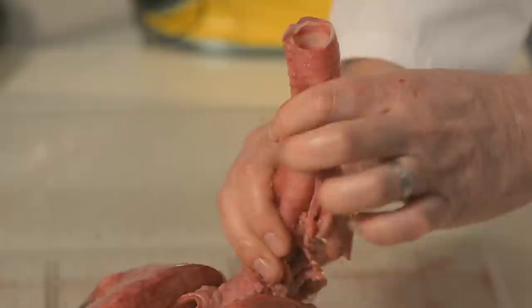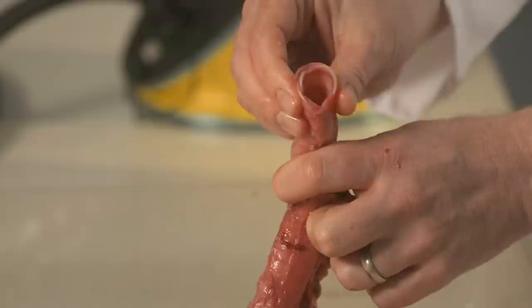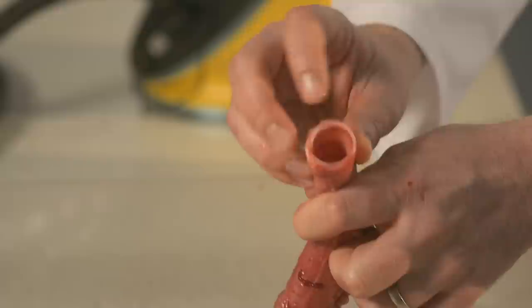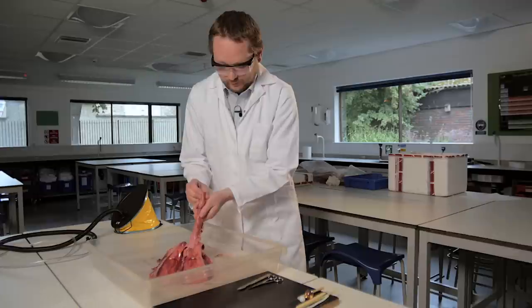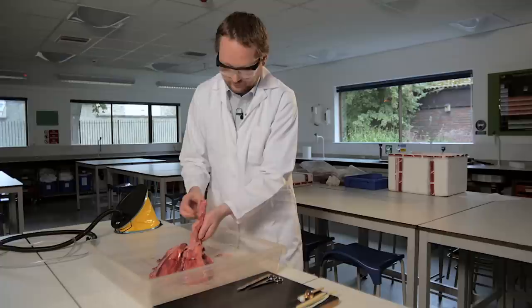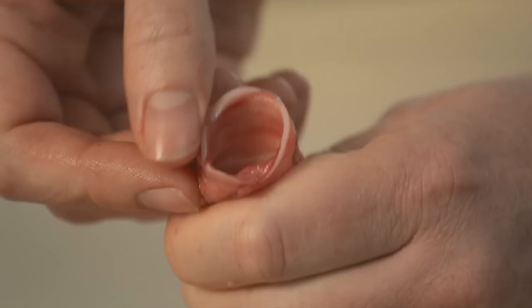The very first thing to look at, I think, is the trachea, a tube that is held open by these rings of cartilage. And you can see them as the white structures in this cutoff section here. It's a good example of how structure is related to function in this breathing system. The trachea is a tube that transports air and it needs to be permanently open. And so these C-shaped rings of cartilage hold that open.